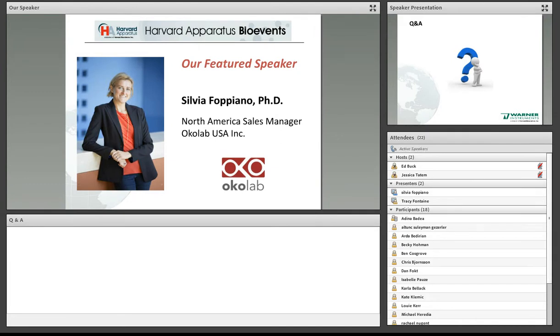So for upright systems, again, it depends on if you want to do a cage or a stage top. If you're doing a cage system, it's extremely simple because the microscope, again, is enclosed and it's at 37 degrees. Your challenge, if you will, is to make sure that you can have your humidified gas contained because at this point, your objective is coming from the top.